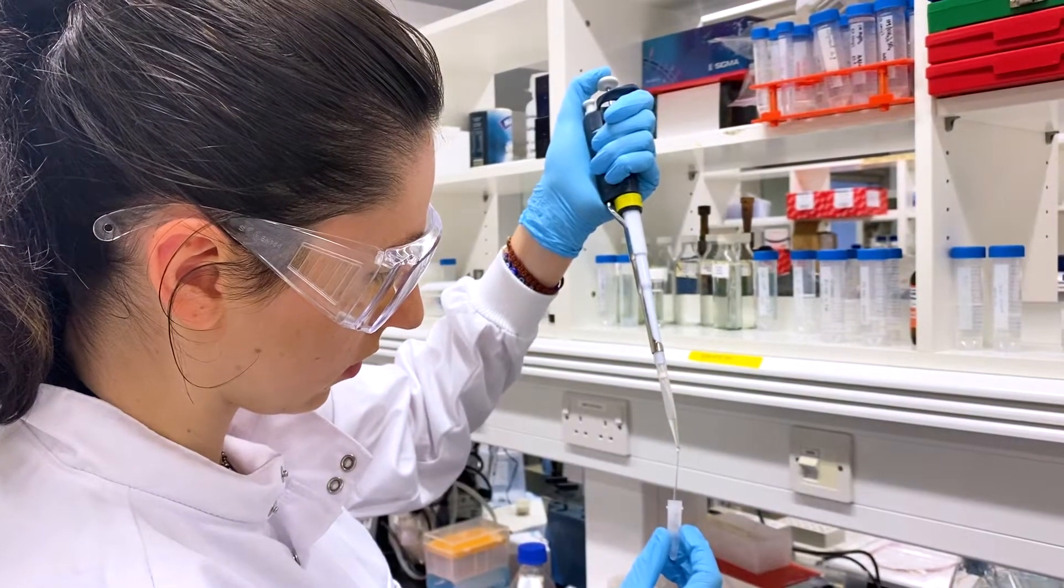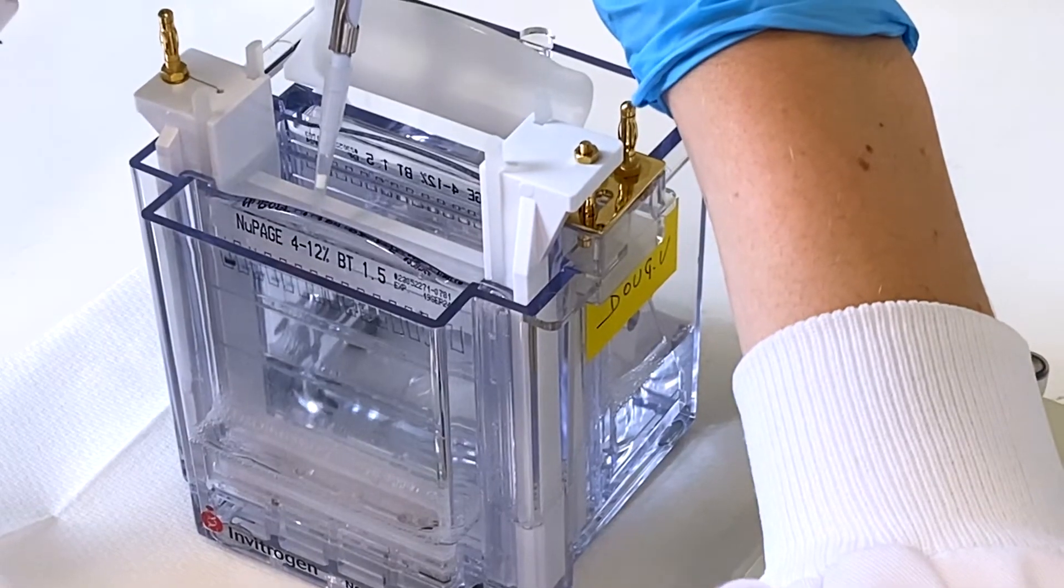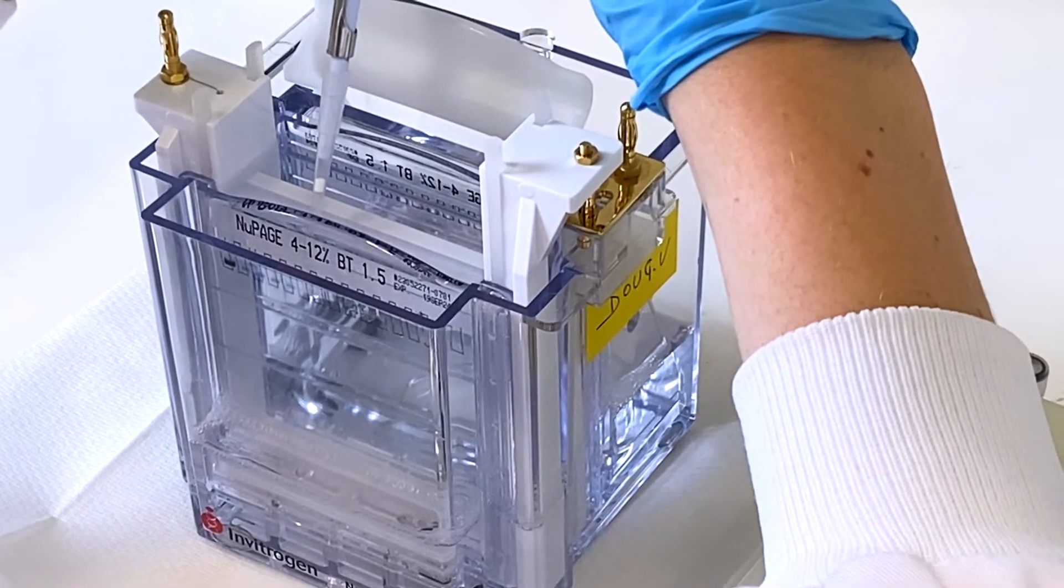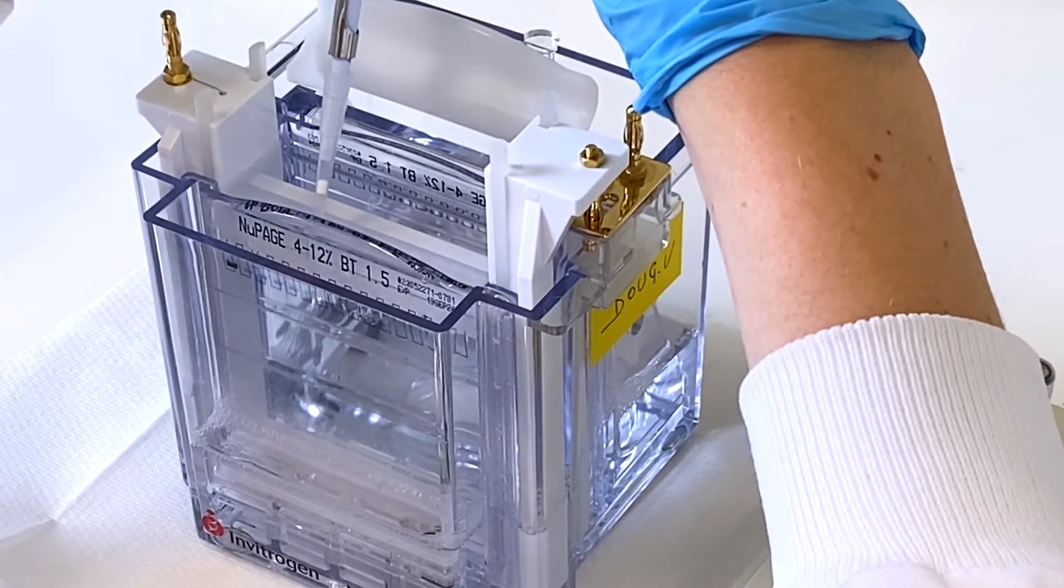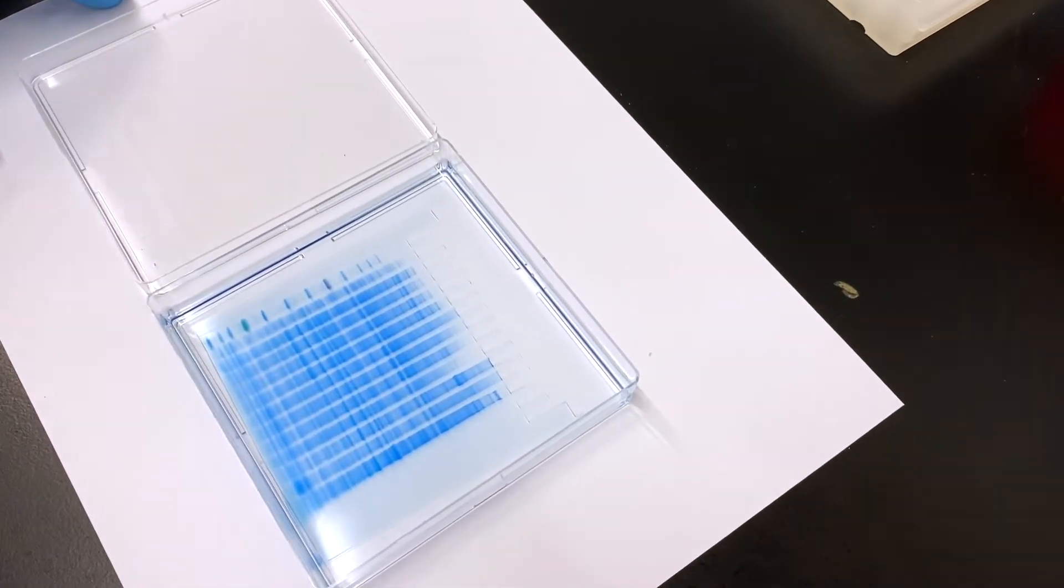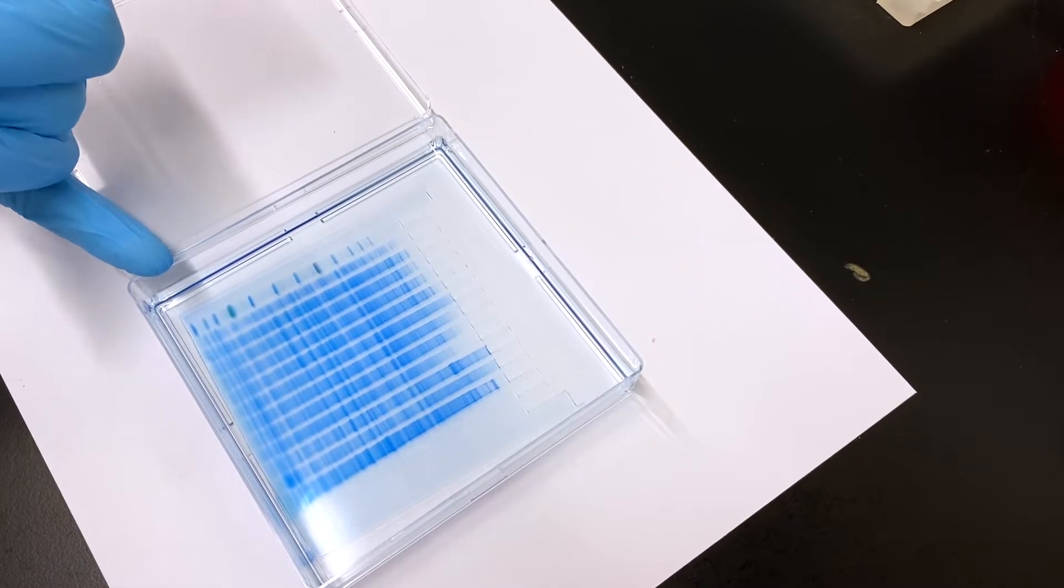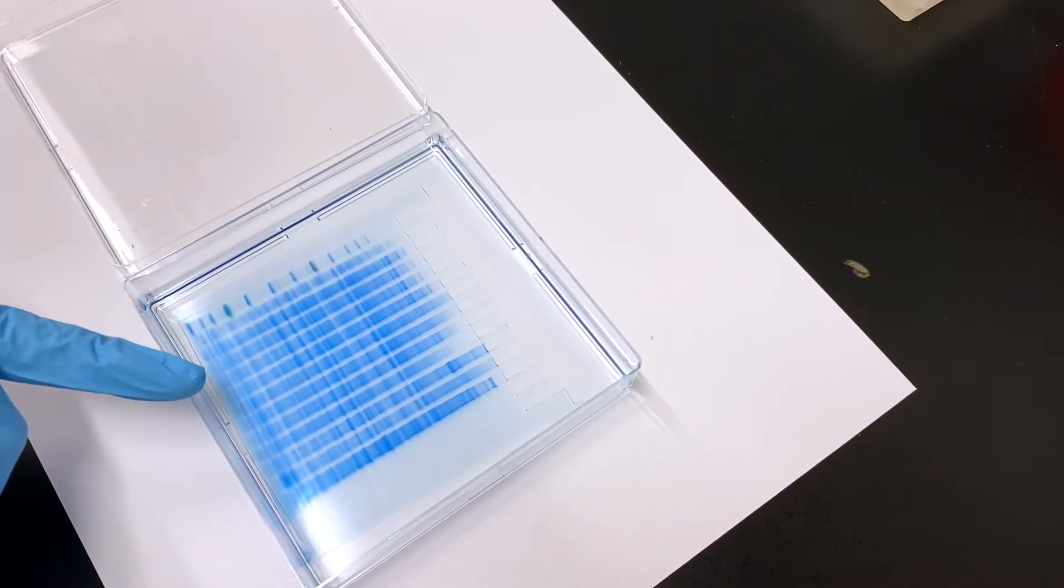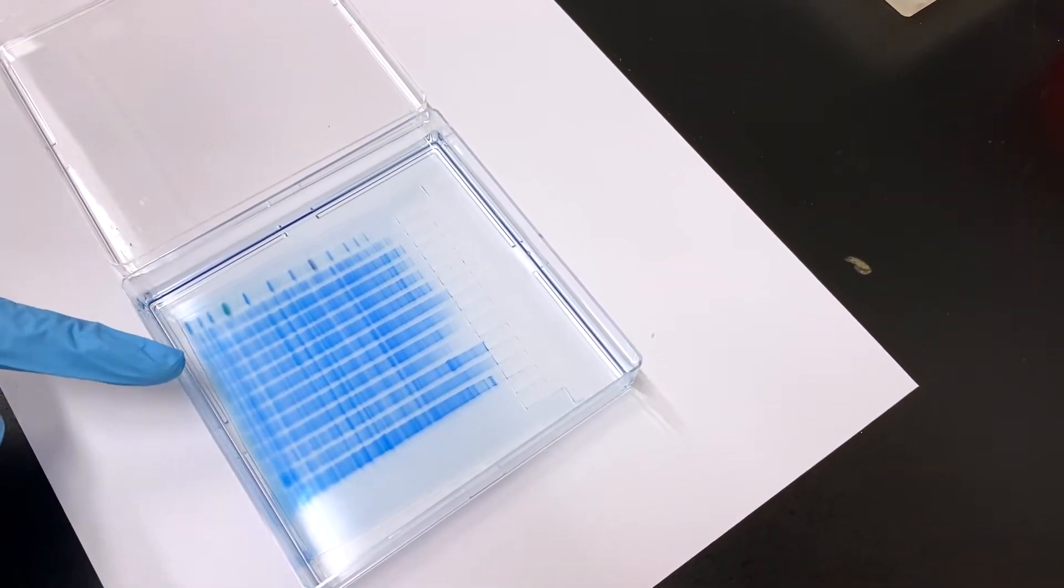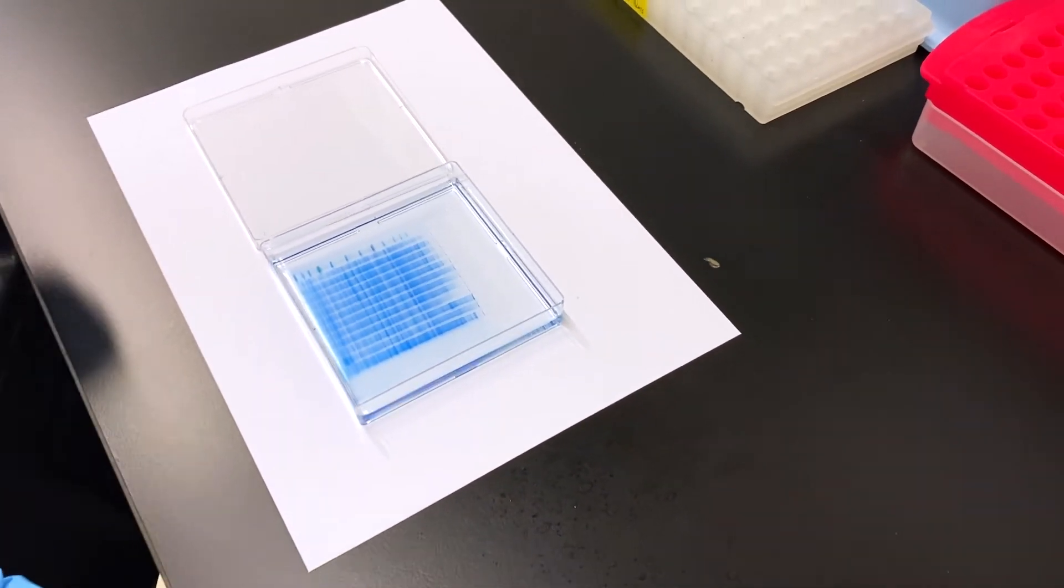The final cell lysates are made up of proteins, RNA and genomic DNA, the proteins of which can be separated using a process called electrophoresis. The proteins can be visualized on the gel by Coomassie staining, which you can see here. The first lane on the left is the ladder, which is our reference for protein sizes. As you can see, lanes 2-5 and 6-11 have different protein compositions since they are two different cell types.